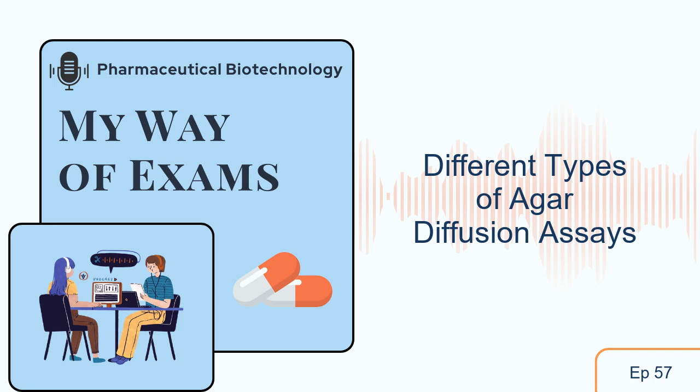The size of that zone can give us a clue about how effective that substance is. But it's not just about the size, it's also about how well the substance can spread out. It's a bit of a balancing act. Basically, we're talking about the techniques behind how we discover and test new medicines to fight infections. So let's jump right in. We've got a few different methods to unpack here. First up, the well diffusion method. So what's the deal with that one?